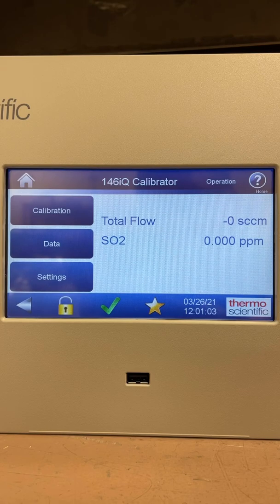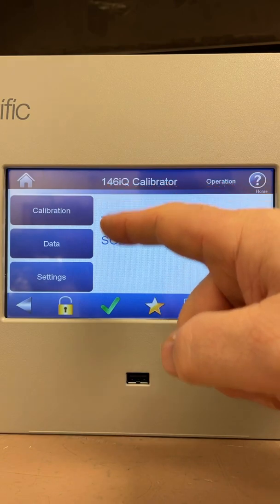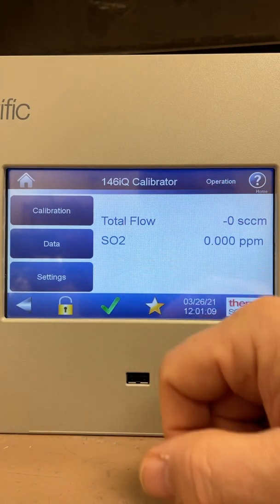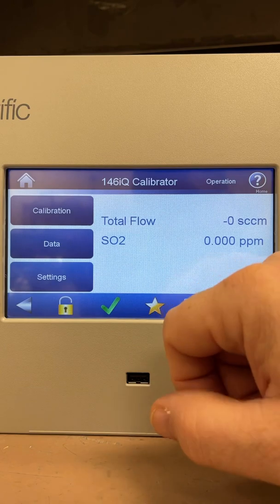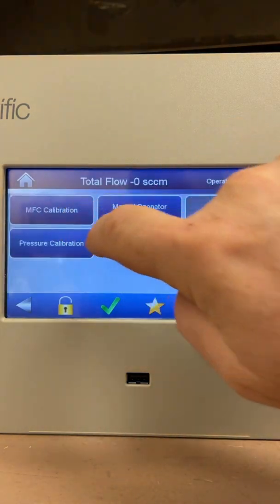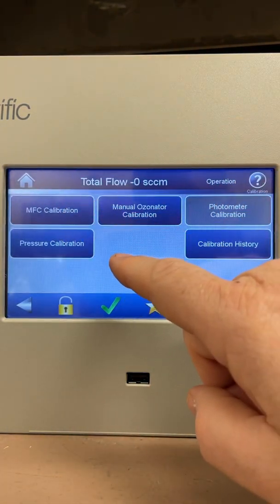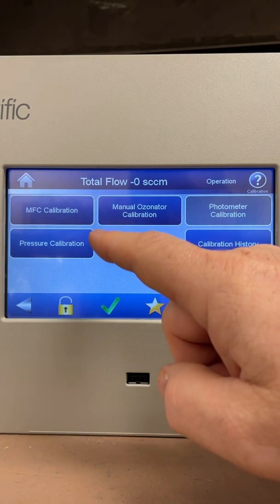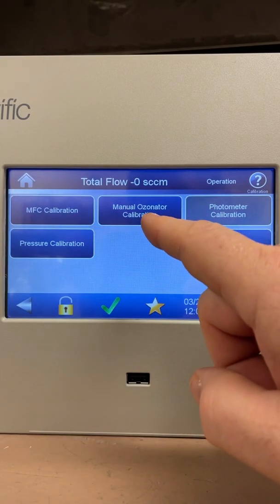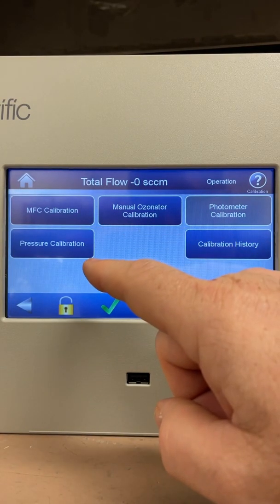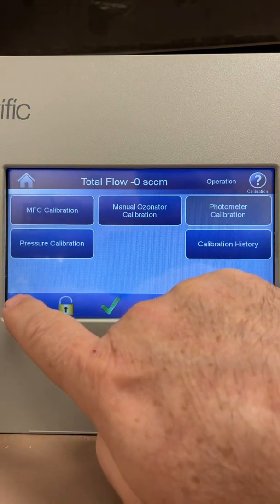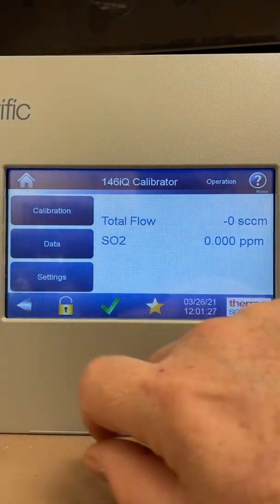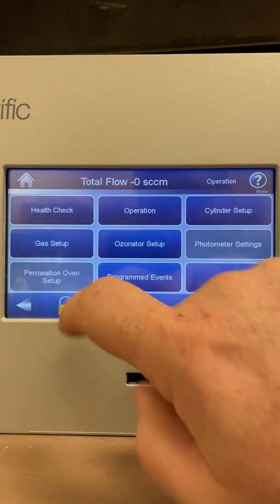Looking at the main screen, we show calibration data and settings. To operate the calibrator, it isn't actually the calibration screen that you go into — this screen is just to calibrate your mass flow controllers, manual ozonator calibration, pressure sensor calibration, that sort of thing. The screen you would go into to operate this calibrator is Settings and then Operation.